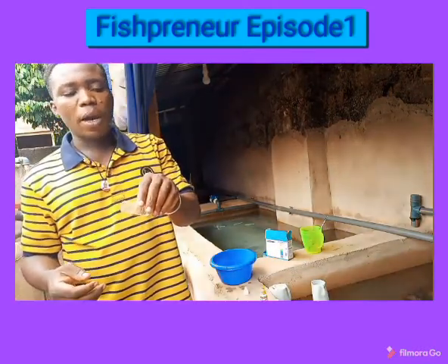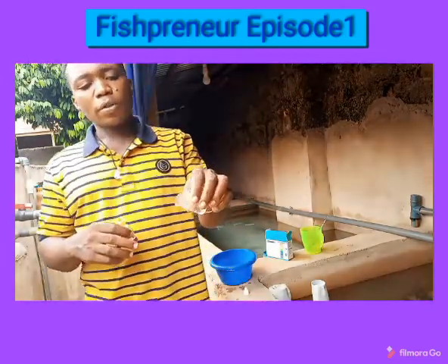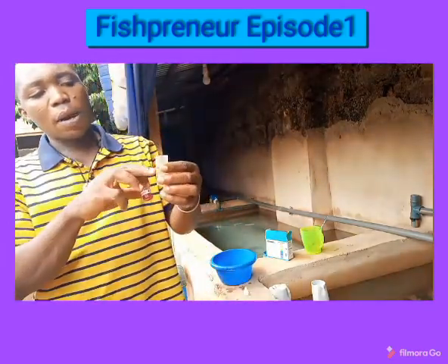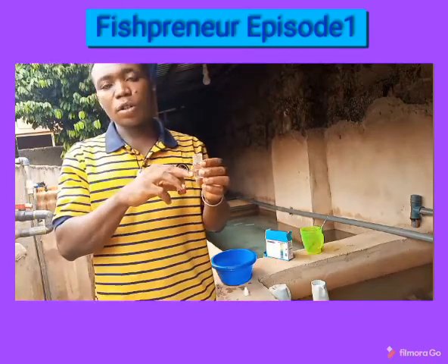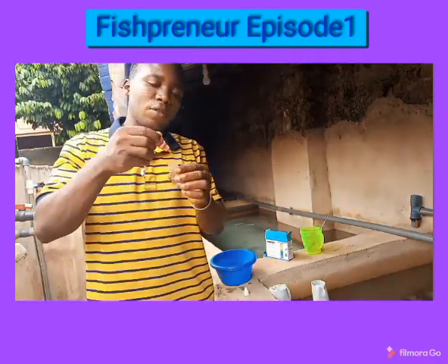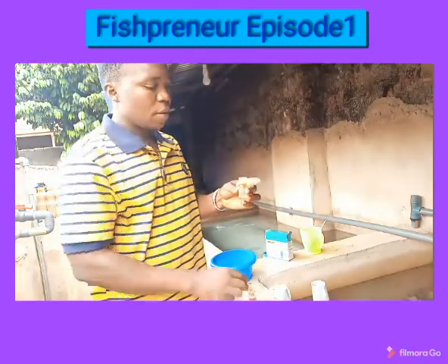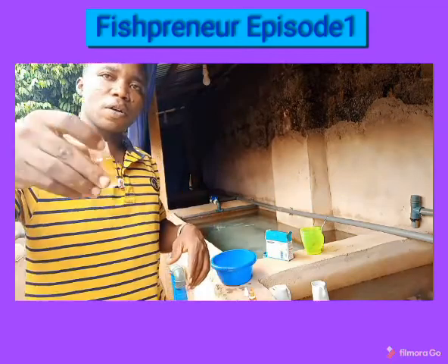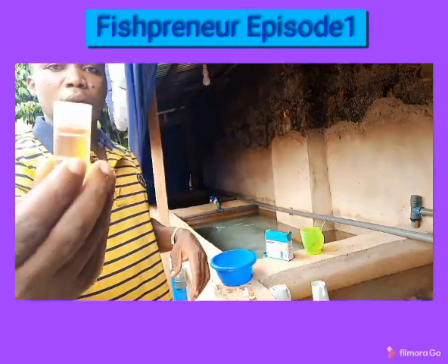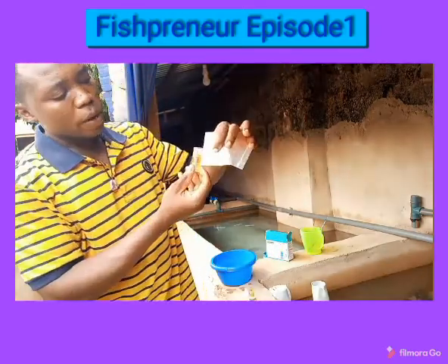This beaker normally comes along with the test kit. Ensure it is around 10 ml according to the instructions given. I'm going to add two drops of the reagent. After adding these two drops, you can see the color — it looks red.